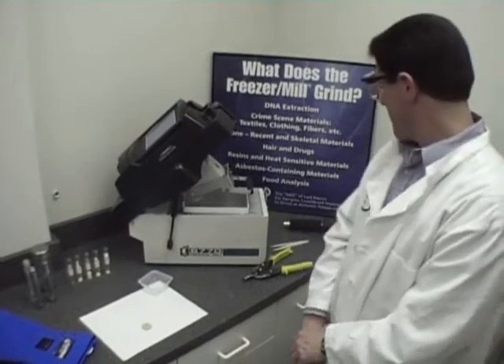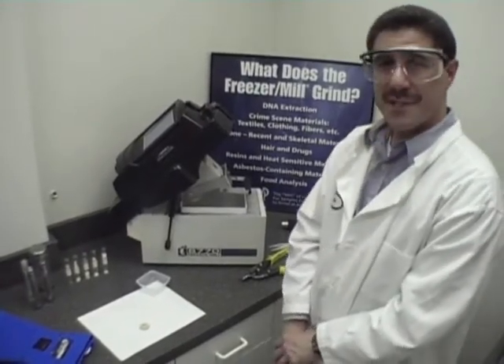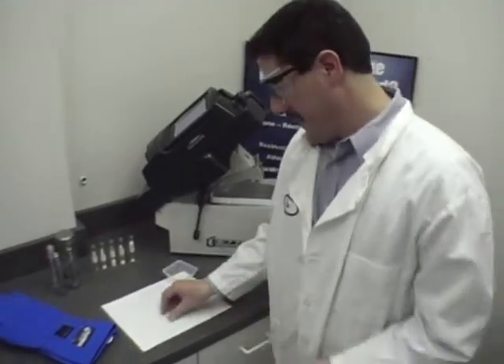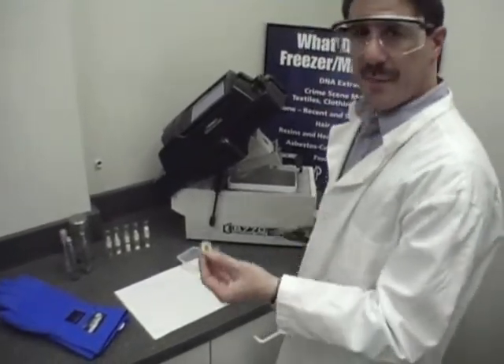The Freezer Mill is sometimes known as the mill of last resort for samples that were once considered impossible to grind at room temperature. Today, just for example, we're going to be grinding a piece of leather.